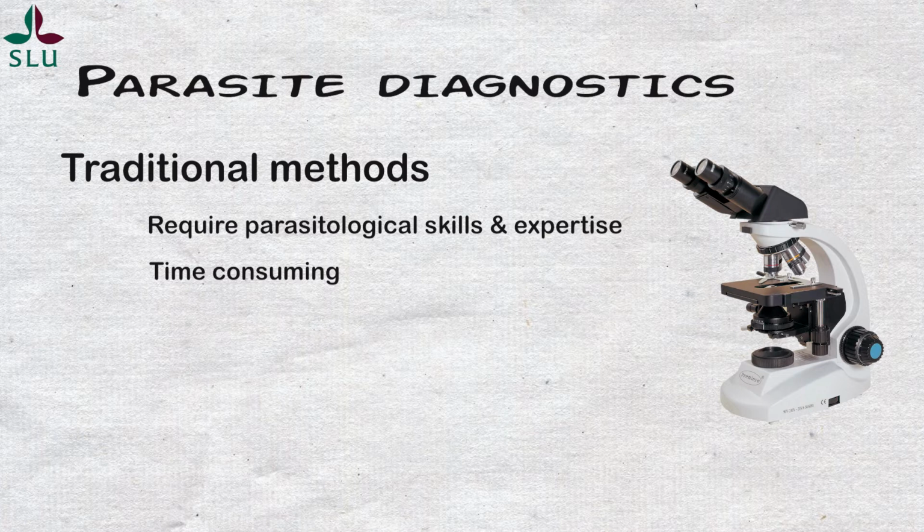Furthermore, as larval differentiation is based on minor morphological characteristics, parasitological expertise is required. But even then, the procedure is not always reliable due to culture bias.